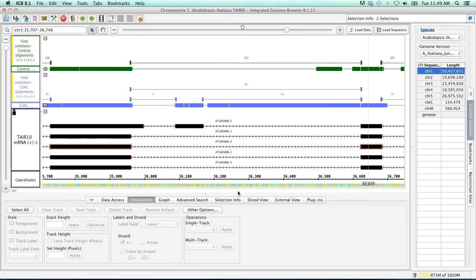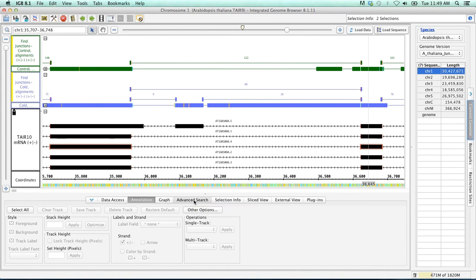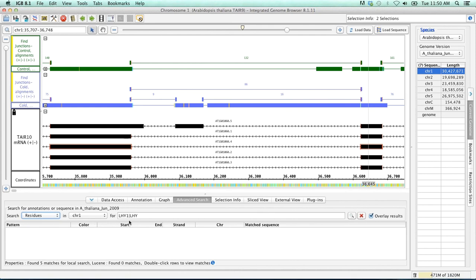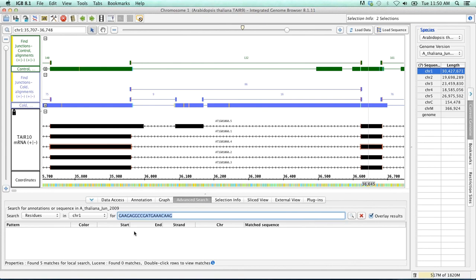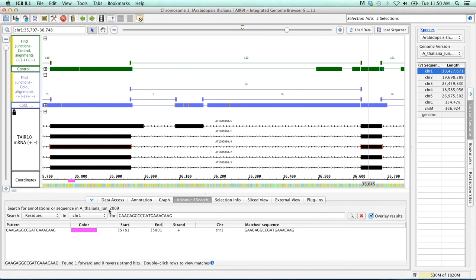Now, in order to search for primers or residues, we would use the Advanced Search tab. In the Advanced Search, go down to this Search drop-down box, select Residues. I'm just going to get rid of that. And then we're going to paste in our first forward primer and search. As you can see, IGBE has very quickly found it and located it within our left flanking exon.